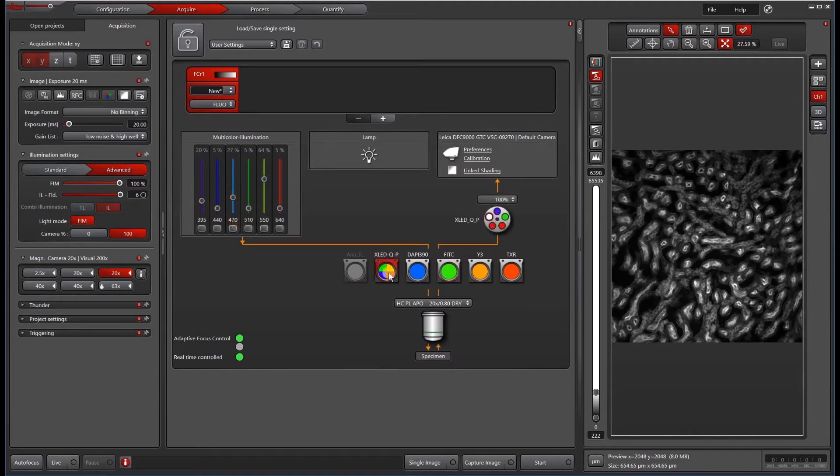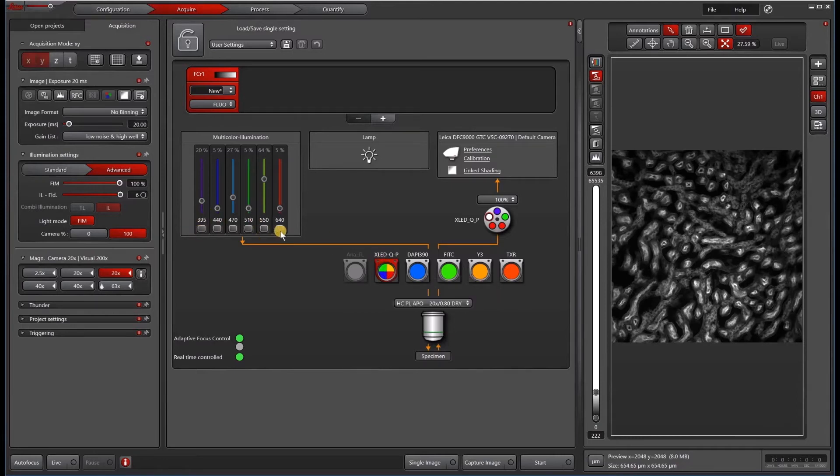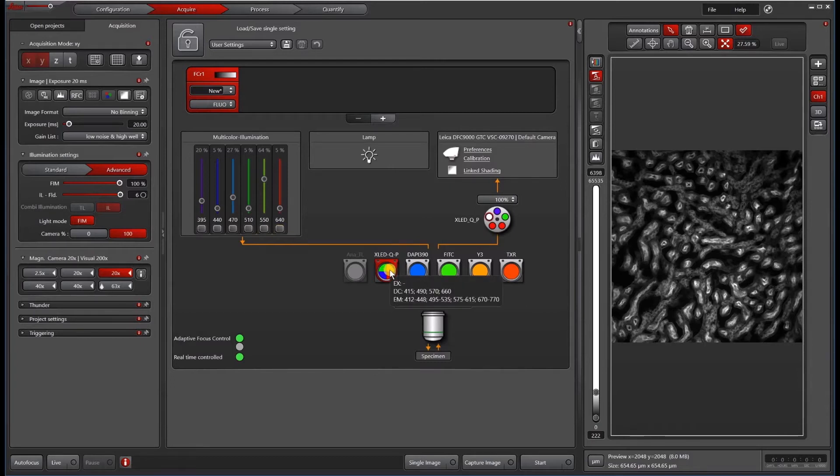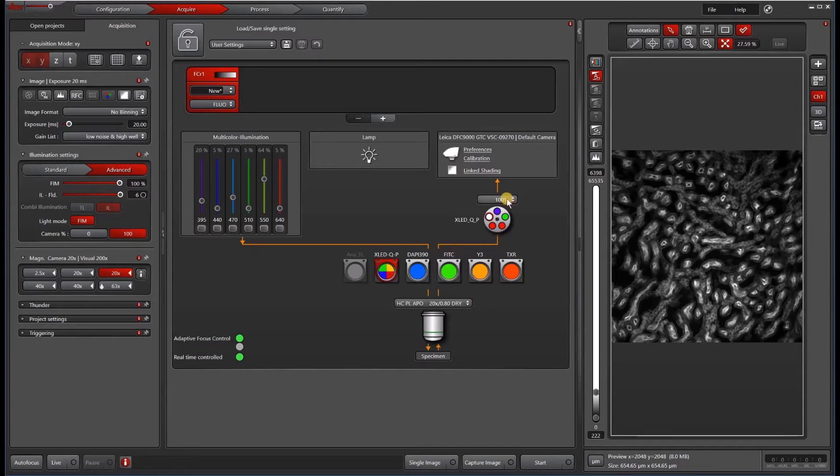One interesting thing about the quad cube is because it has no excitation filter on this particular quad, I can select any of these six lines for excitation. However, if you look at the bandpass filters for the emission, I can only let through these four bandpass filters. And now to clean up this emission filter, I also have these five options available in the external filter wheel.